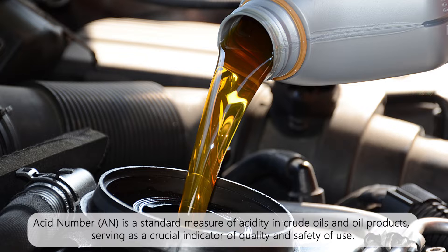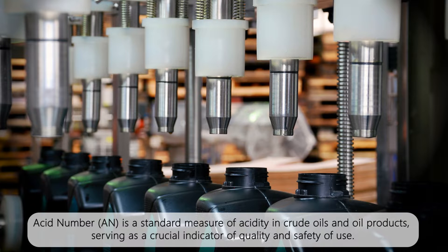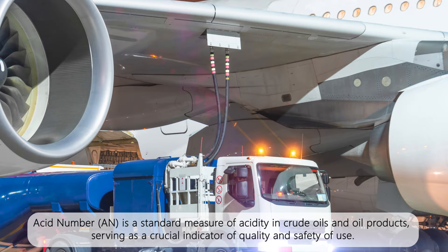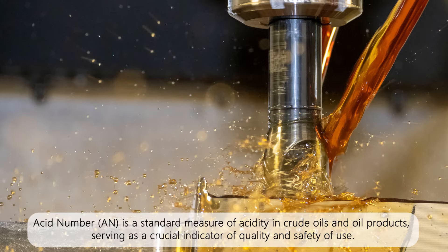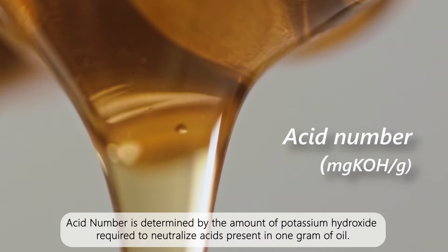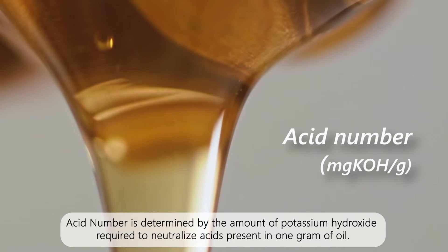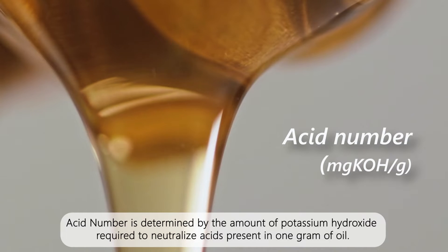Acid number is a standard measure of acidity in crude oils and oil products, serving as a crucial indicator of quality and safety of use. Acid number is determined by the amount of potassium hydroxide required to neutralize acids present in one gram of oil.